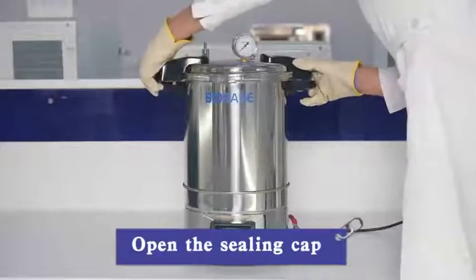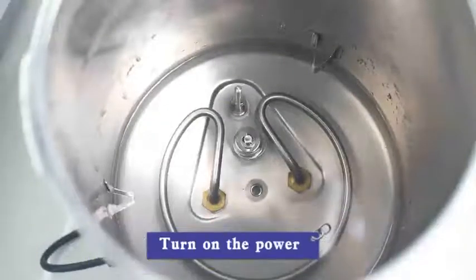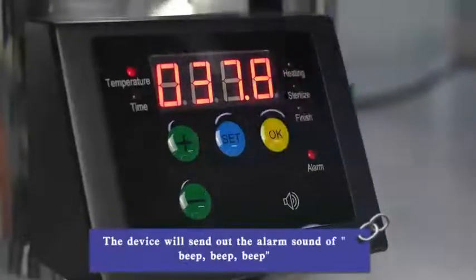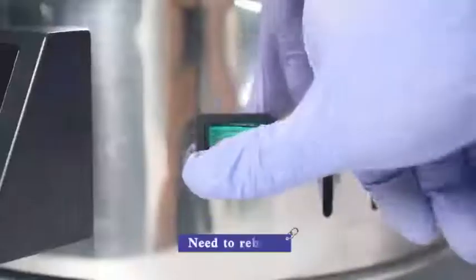Wear a protective glove and open the sealing cap. If there is no water or insufficient water in the cavity, turn on the power — at this time the alarm light will light up. After pressing the OK button, the device will send out an alarm sound of beep, beep, beep. To silence the alarm, you need to reboot the device.